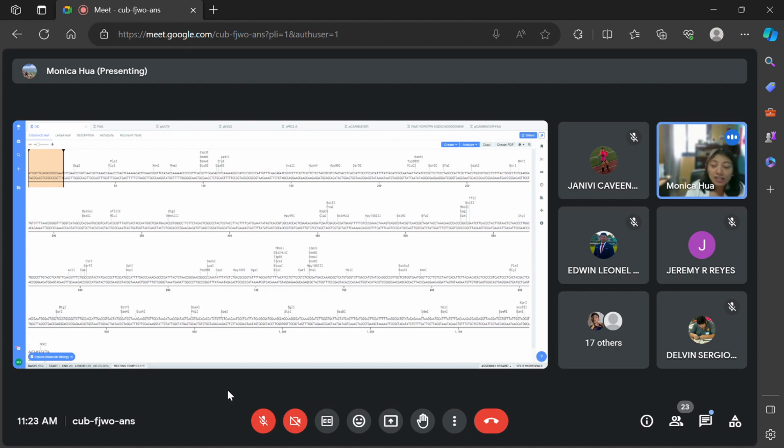The GC content will be best if it's below 50%, but it cannot be too low. I think 50% is the ideal, around 40 to 50. So 65 is a little bit too much. I have to see how I can adjust it. Sheesh, that GC is high.